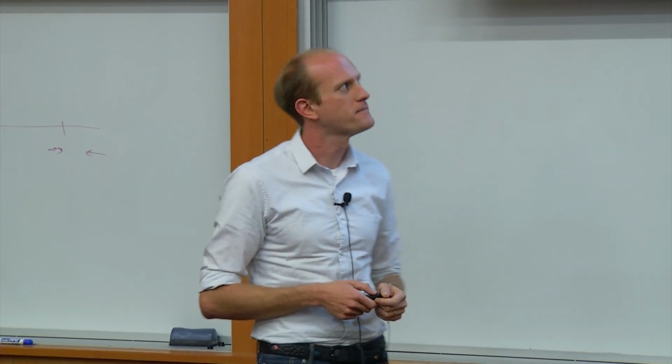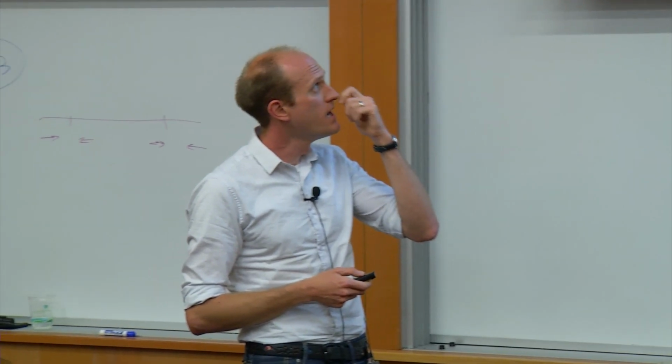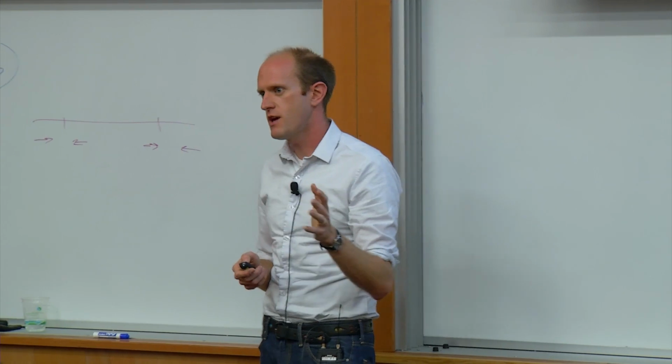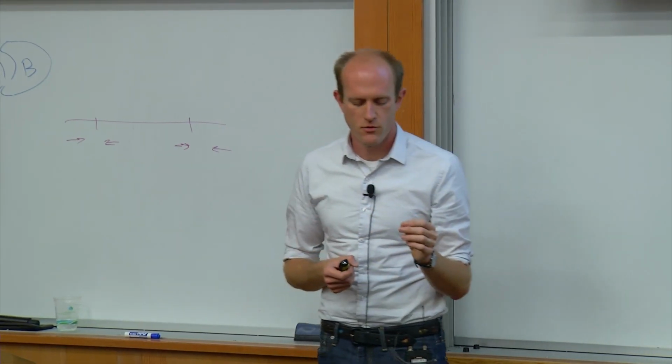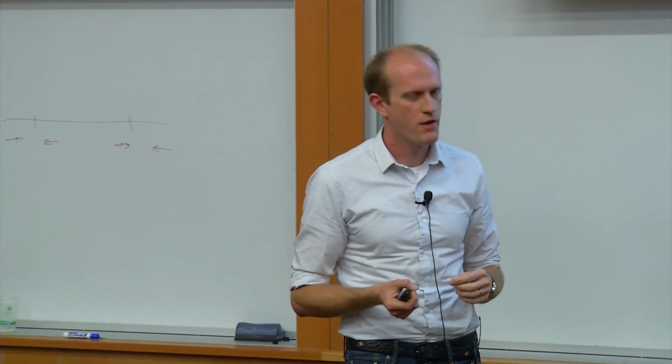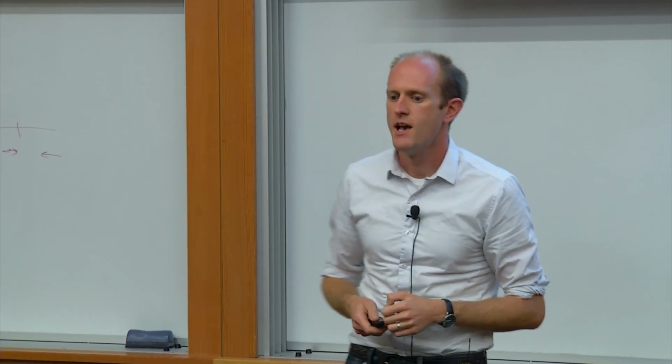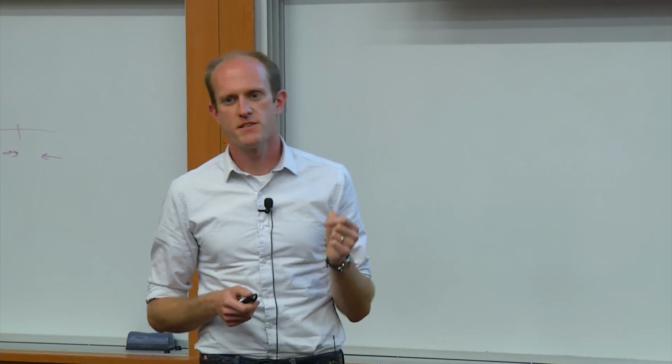Okay? The other thing I want to point out is that this uses the UCSC server. I talked to you guys about how you choose off-targets and how those are called. So this uses the UCSC set of genes. It calls those genes based on exons.